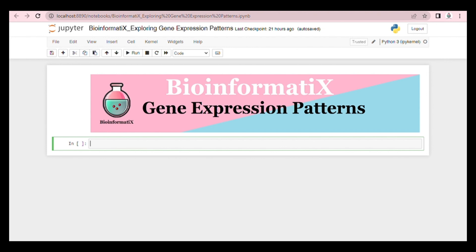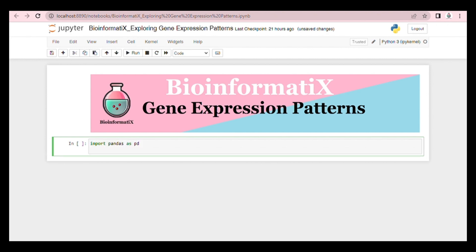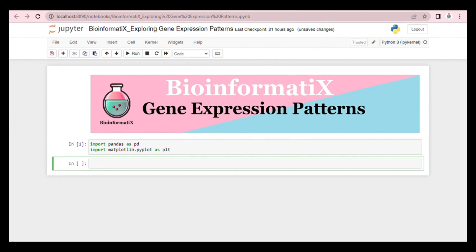Firstly, we import our libraries. Then we read the gene expression data from our CSV file.